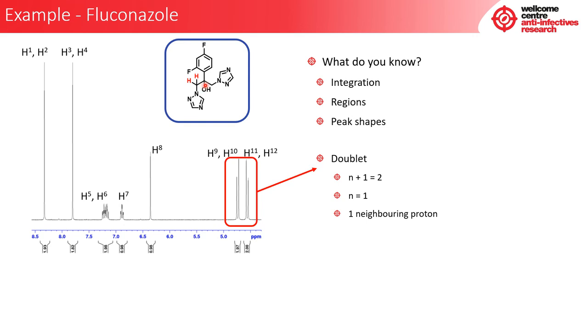Quaternary, meaning it's not going to have a hydrogen atom attached onto it. So we say, well, where is it getting this neighbouring from then? Because in theory, it should therefore appear as a singlet. It doesn't have any neighbours.